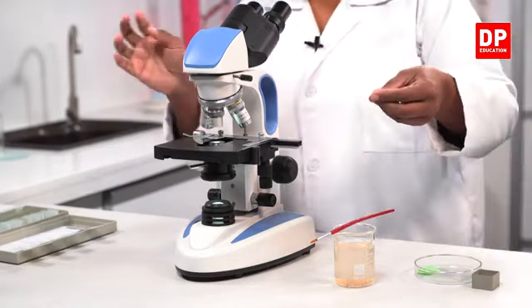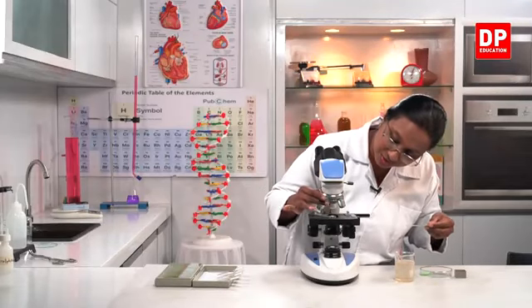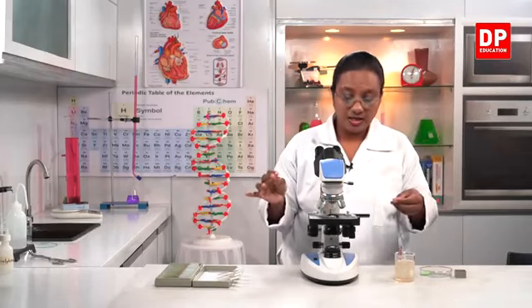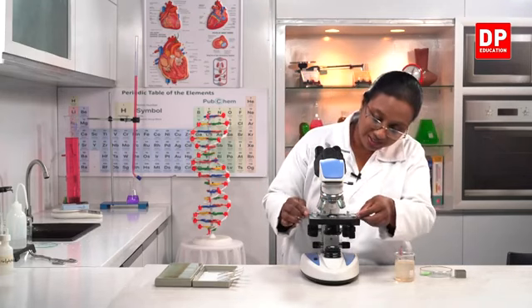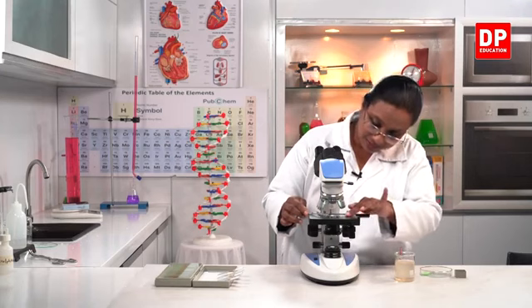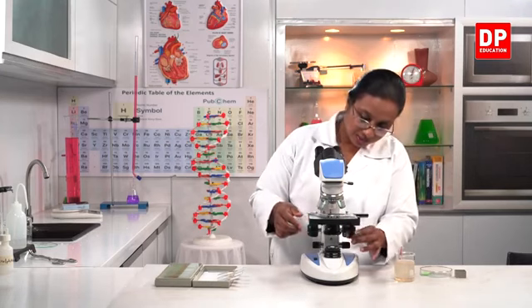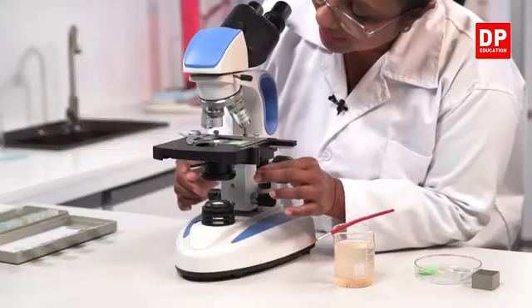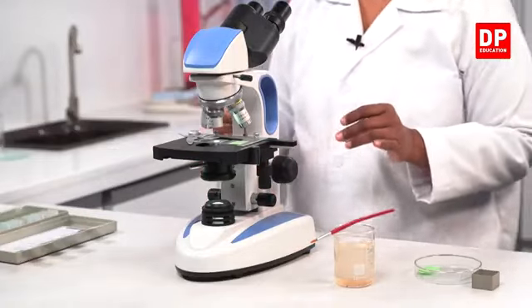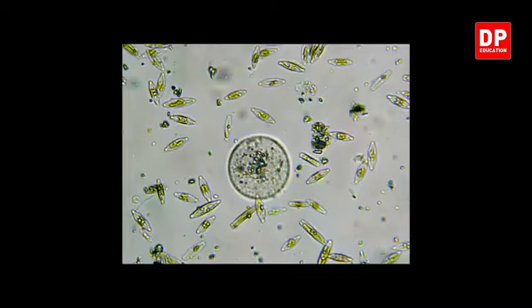So now we have to make sure the microscope is on. Everything is known to you, and it has to be in low power, and there should be enough light falling on the stage. Then we place the slide that I prepared on the stage, and I'll make sure that the specimen is in place with the lens. Right. So now we will observe it under low power.